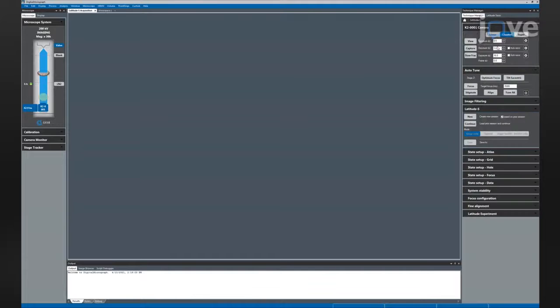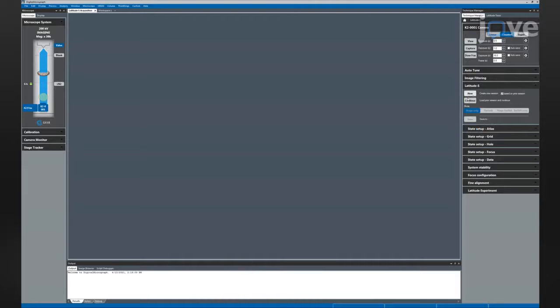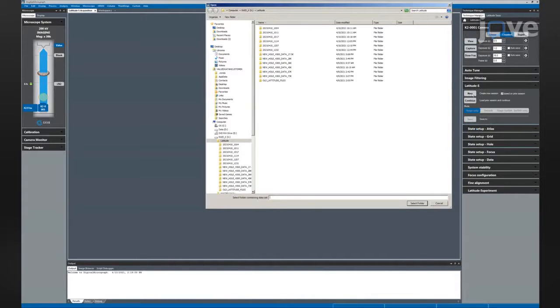To create a session based on the previous session settings, check the Based on Prior Session checkbox in the palette and then select the New button. Or to continue an existing session, press the Continue button.